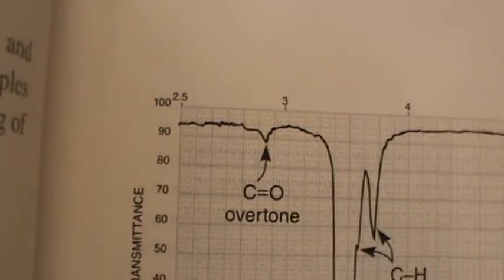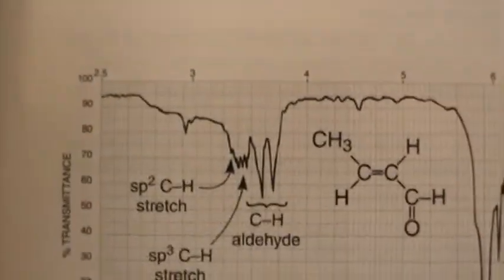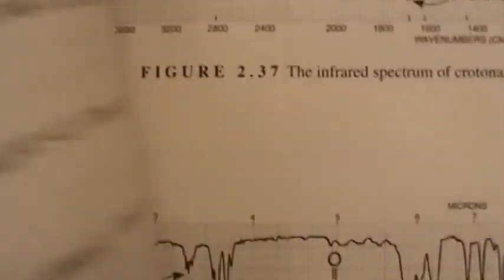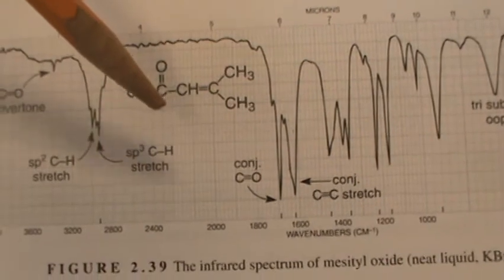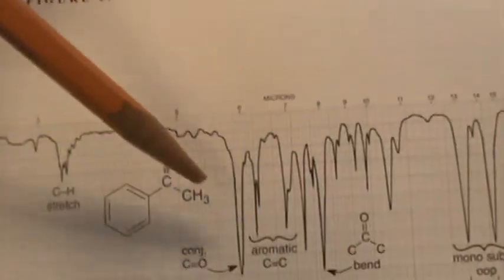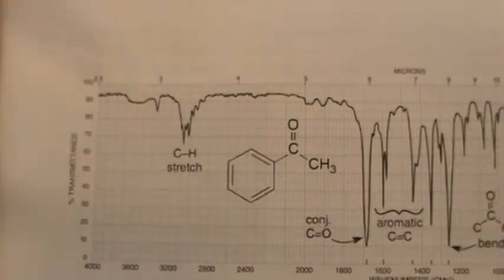And notice how if over there you see a spike, that's a CO stretch overtone. Each one of these spectra has it. Sometimes he labels it, sometimes he doesn't. But when you see that characteristic little spike, and let's flip the page, see what he has here. Ketones. He's doing it again here. There's that little overtone. He has this one, obviously, he has a double bond that's close to it. That's why that one looks that way. This one has a strong carbonyl, but there's that spike of CO overtone. That basically handles it, folks, for that. So I think we're good.